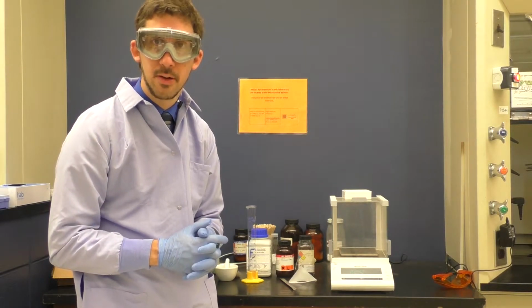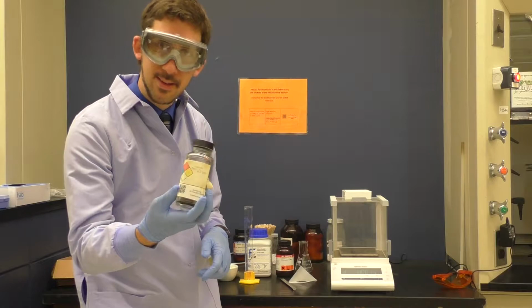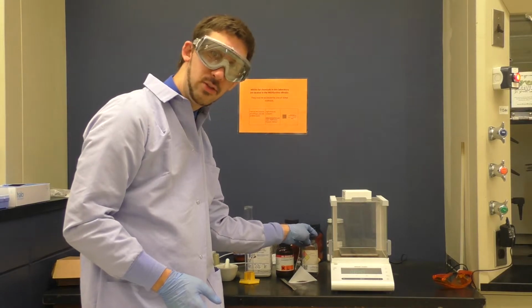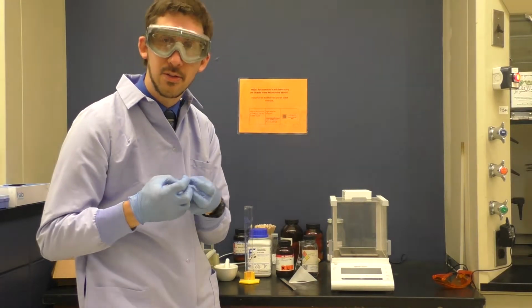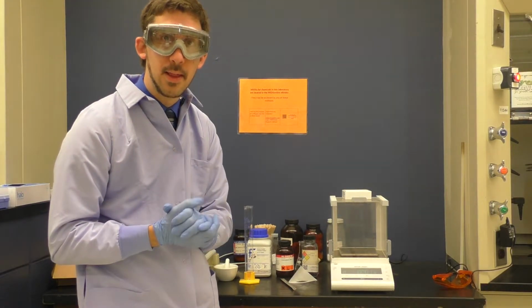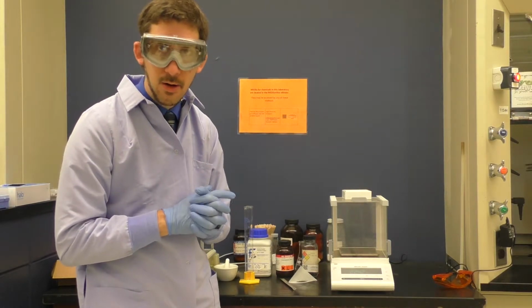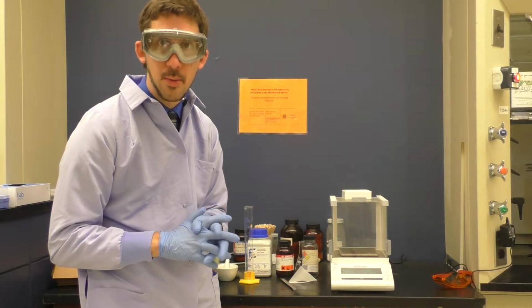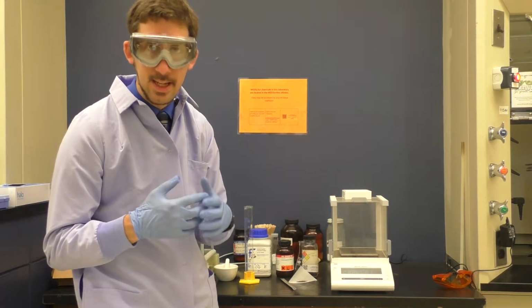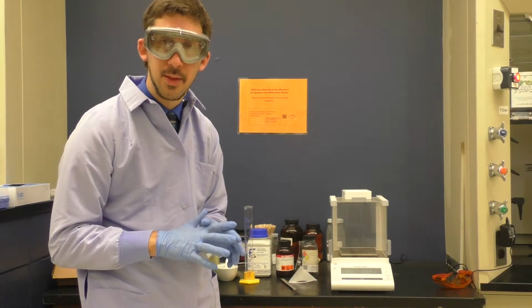And then we'll add a high surface area material, in this case, charcoal. So another species that looks just like the species we just had weighed out. But this high surface area material will adsorb a lot of the polymeric materials onto it. And then when we filter, we will remove the charcoal and much of the colored impurities. Now, the final solution will not be clear in any respect. It will still be colored, but hopefully less colored, more clarified relative to the starting material, less completely and utterly black. And then we'll be able to carry that forward and react it with the acetic anhydride.